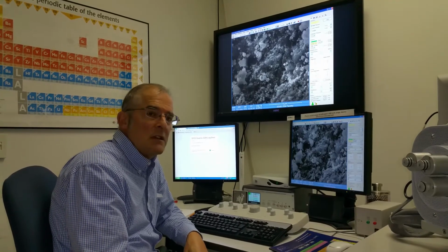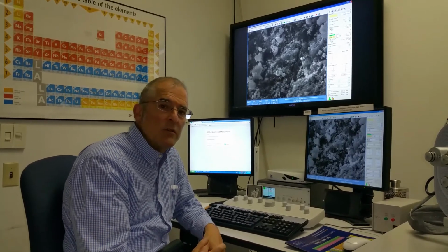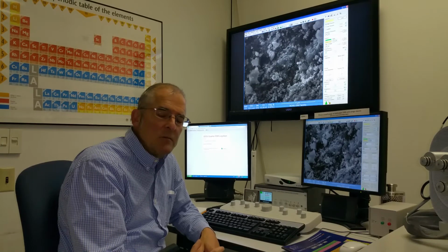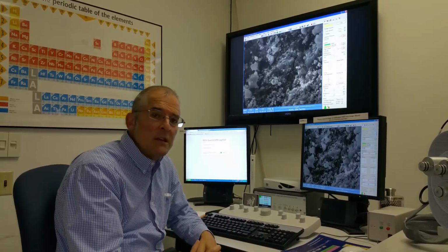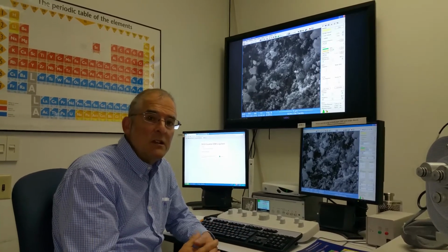The instrument itself is located at San Diego State University. It's a member of the California State University system, which was originally a teachers college that then became a college for students, and then more recently it's become a university, and over the years has developed a strong research program with the faculty members who've been hired to teach classes and also then get engaged in scientific research, which they involve their students in.